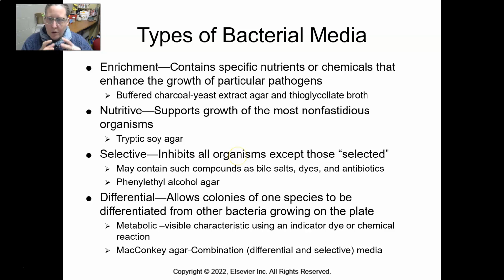So again, agar is kind of like the base, and in the liquid, liquid can be the broth. There are different things that we can mix into or make them into. So we can make them into enrichment media. So they contain specific nutrients or chemicals that can enhance the growth of particular pathogens. So your buffered charcoal yeast extract agar is an example there. We can use that one, I believe, for Francisella tularensis. That's one example. Thioglycolate broth, although we use that as a good holding media, extra media.